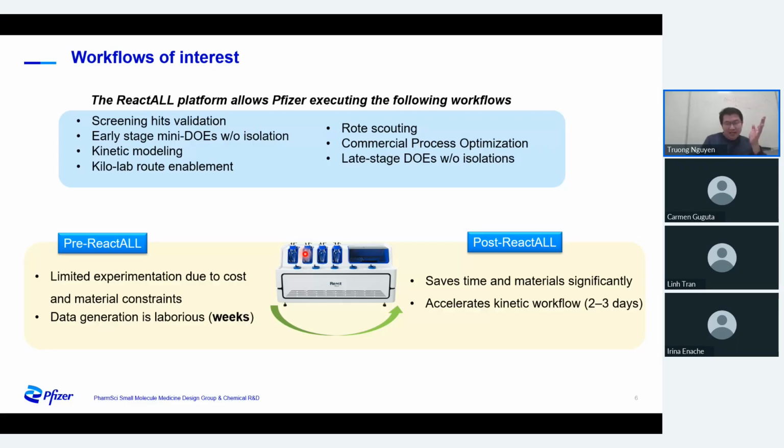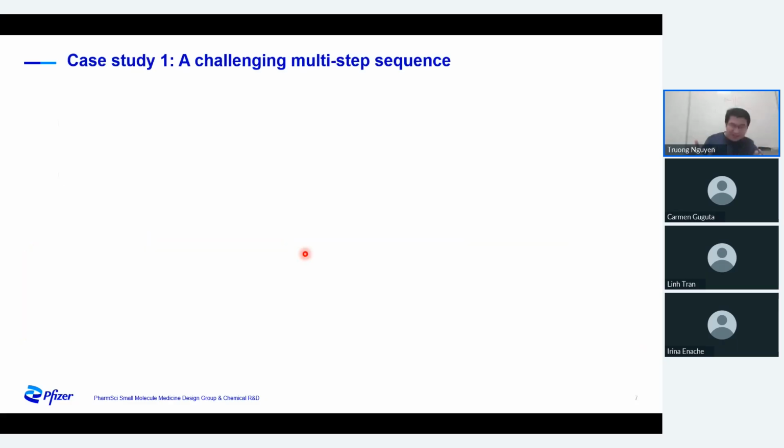So with that, now we know it's reliable to use and what it can be used for. I will show you 3 different cases that basically show it can generate reliable, comparable data compared to other platforms, and we can do certain useful things with the data.